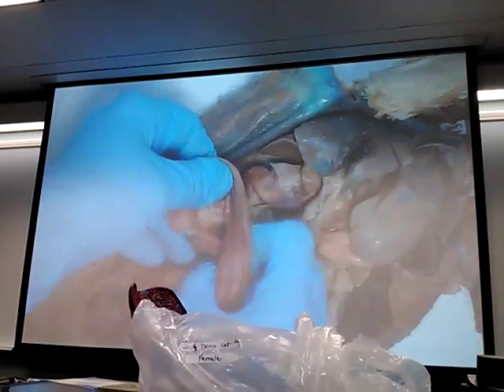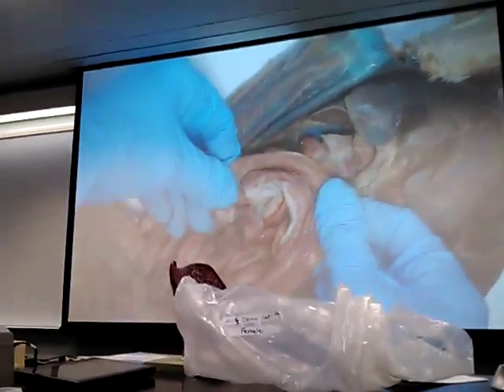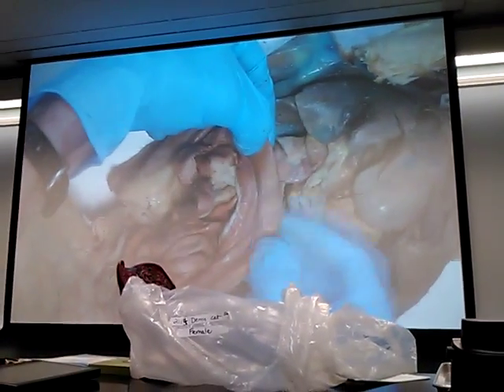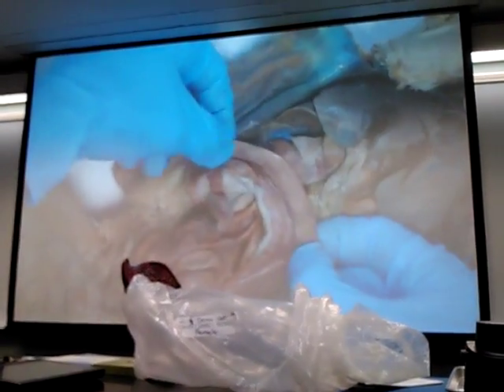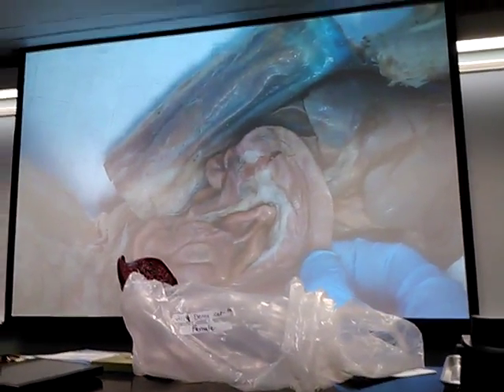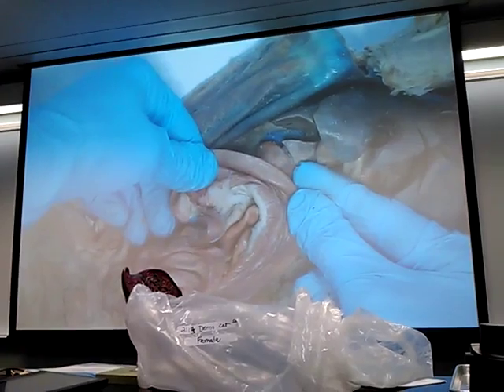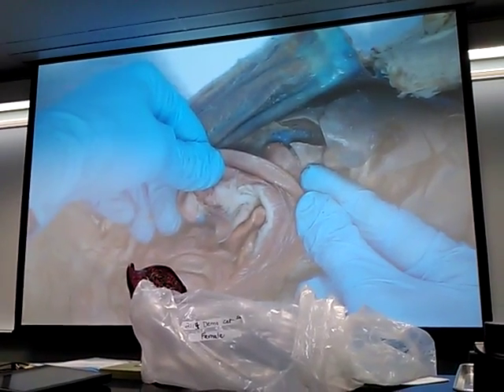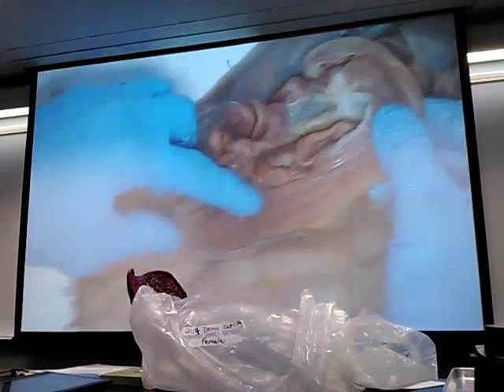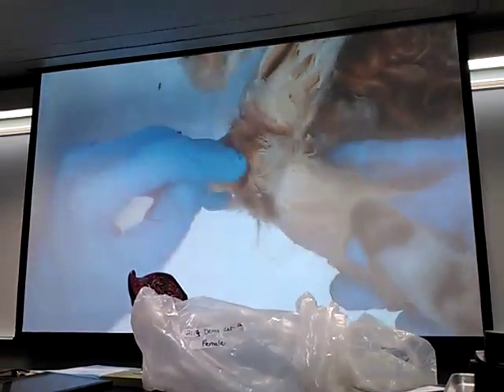Then, okay, so let me arrange this. I'm pinning these all into place. But that would be the cecum. This would be the ascending colon. This would be the hepatic flexure, transverse colon, splenic flexure, because here's the spleen, okay. Descending colon, okay? Make sense? All right. Rectum is going to be the last part. So this will be all rectum right here. And then the anus is just going to be the opening to the outside right there.